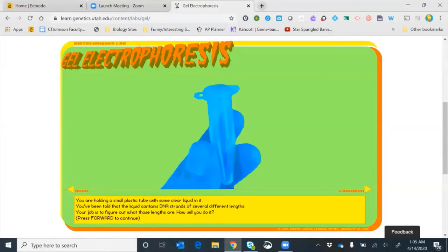Hello AP Biology students, welcome to today's lesson on gel electrophoresis. I'm going to go over the gel electrophoresis virtual lab for those of you who maybe don't have Flash installed on your laptop, desktop, or phone. I'll go through this step by step, giving you an opportunity to fill in all the answers on your activity handout and learn what gel electrophoresis is, how we use it, and what it does.